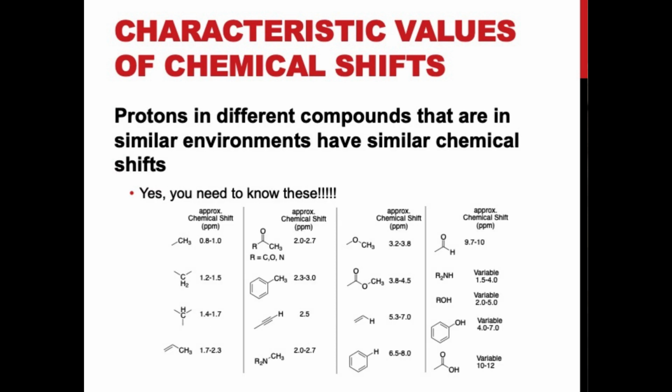So I know, especially here at the end, there was a whole lot of information. What I think you should take away from the chemical shift stuff is that where you come on the scale between 0 and 12 is really important. And there are some easy-ish to remember values that can help you assign structures or assign parts of molecules. So knowing that between 0.8 and 1.7 is just hydrogens on carbons that don't have functional groups on them.